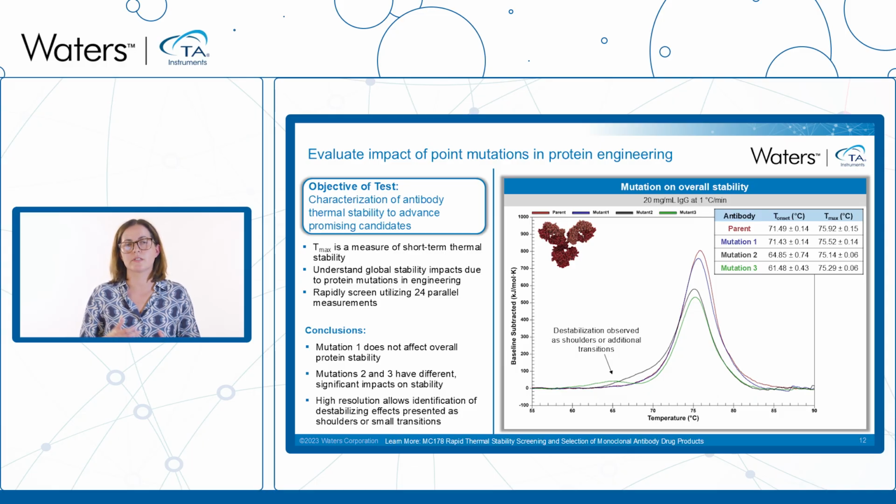in the case of engineered antibodies. So here we see the parent antibody with an unfolding of the CH2, Fab, and CH3 domains that is contained within a major thermal transition with a Tmax of about 76 Celsius.